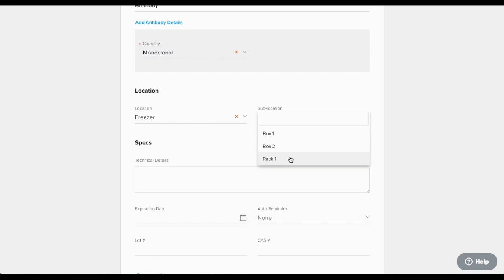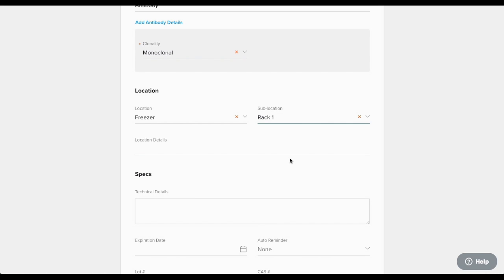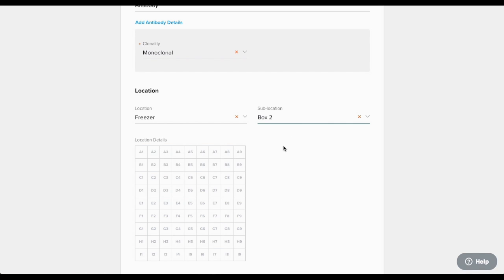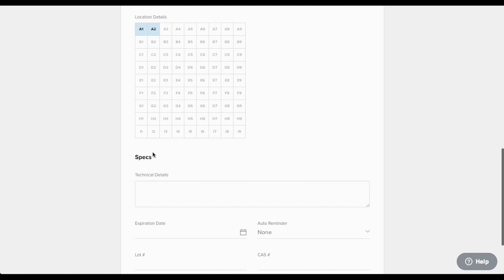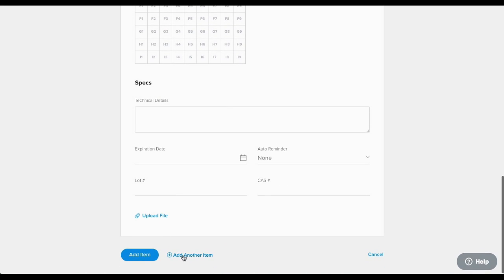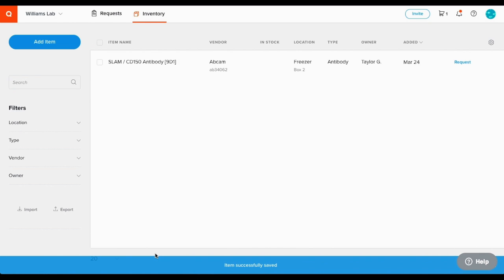For instance, I could put this item on a rack which looks like this, or I can put an item in a freezer box like this box 2 which is interactive. We're all set here, so click add another item to add another item or just click the add item button and there's the item in my inventory.